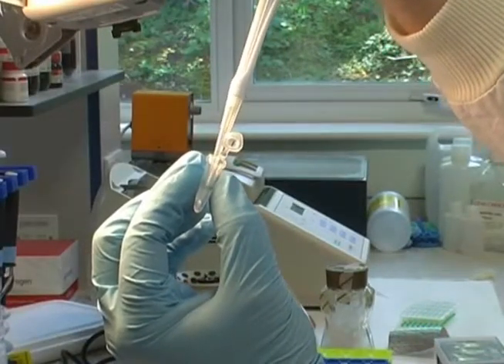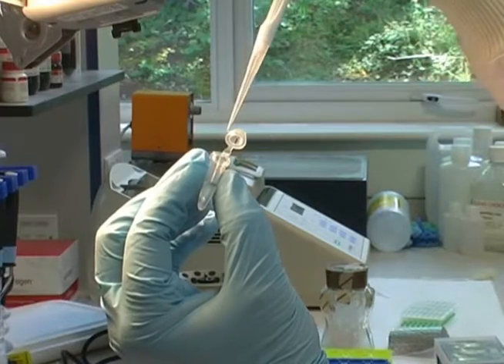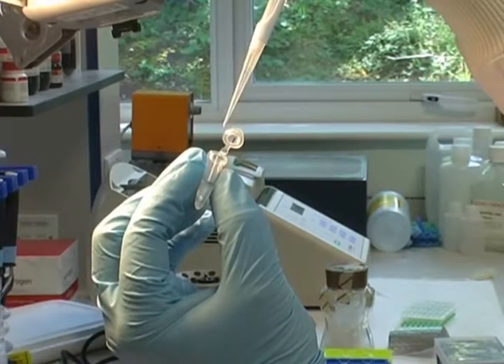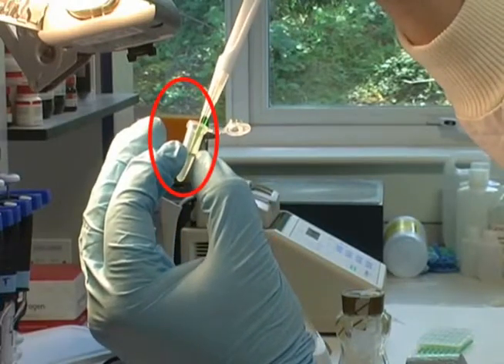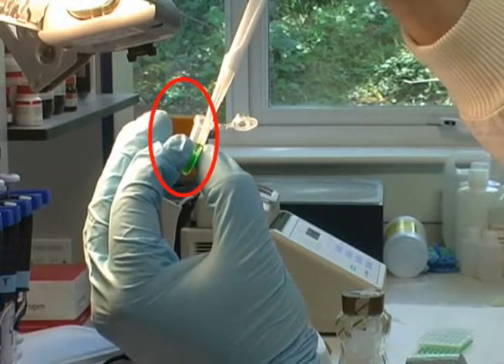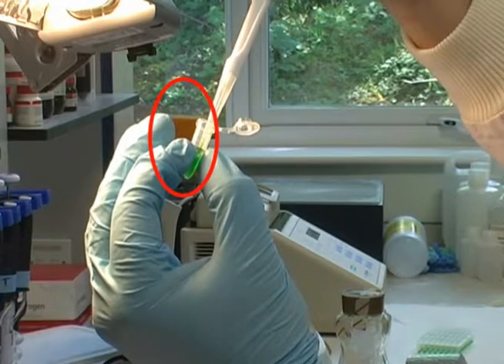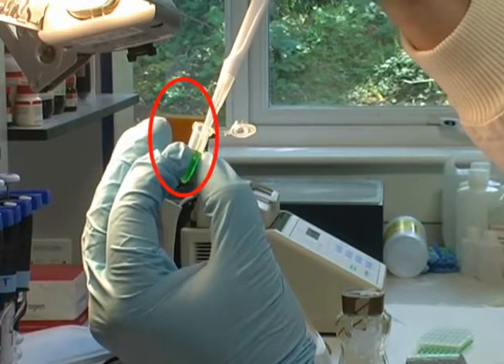Once we have our extracted DNA sample, known as the template, we will start to assemble a range of reagents which constitutes a PCR mix into a sterile tube. This typically takes the form of a master mix containing a colored dye for loading which is mixed with the template DNA and is made up of the following components.